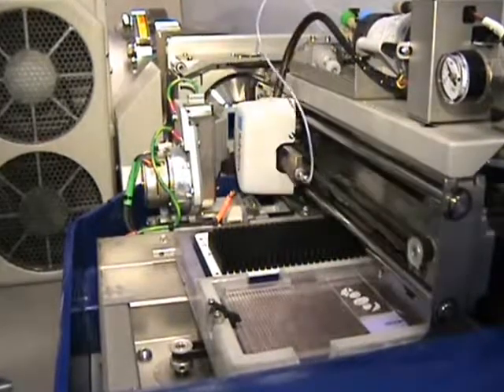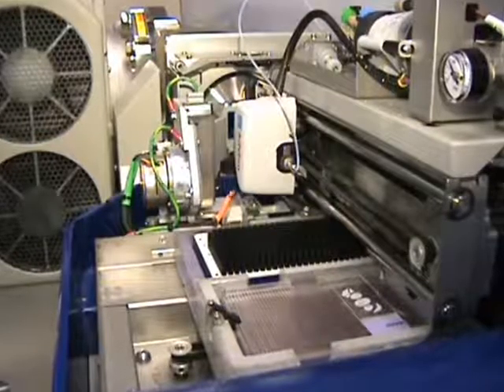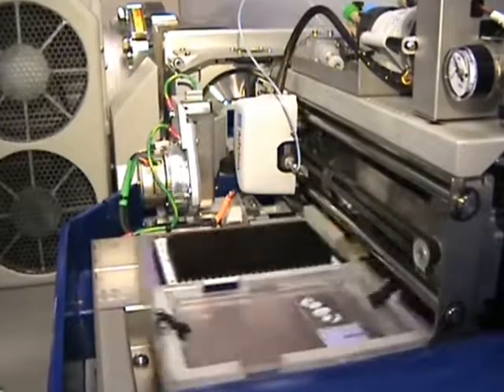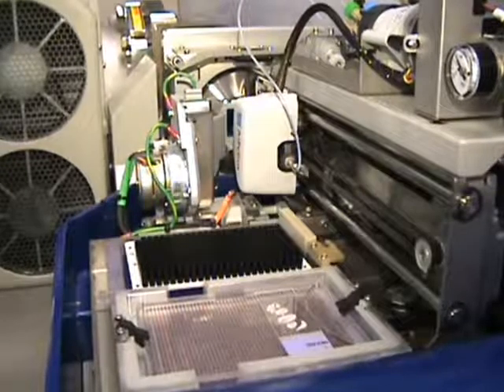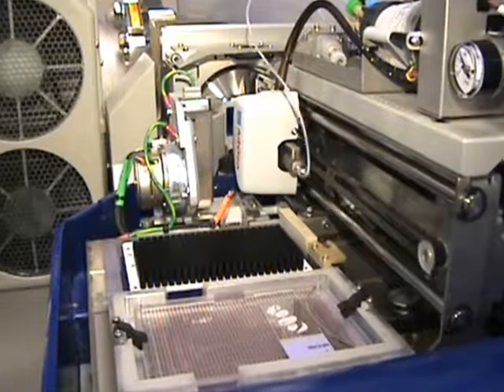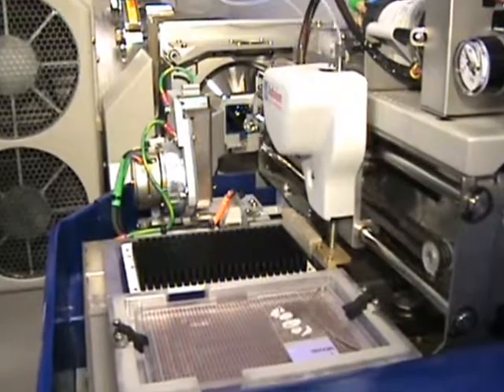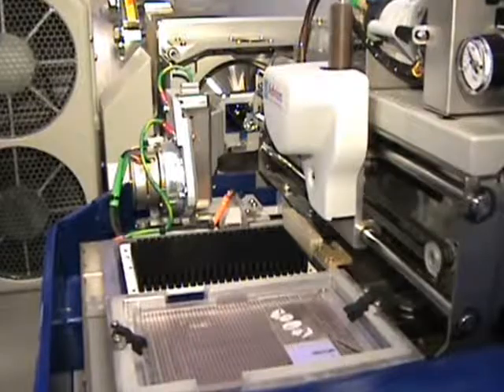The pipet tip is then positioned at a nozzle inlet on the back of the ESI chip. The extract is sprayed through the ESI nozzle of the chip in the normal manner for analysis via nanoelectrospray mass spectrometry. There is zero carry-over from sample to sample because a new pipet tip and nozzle are used for each sample analysis.